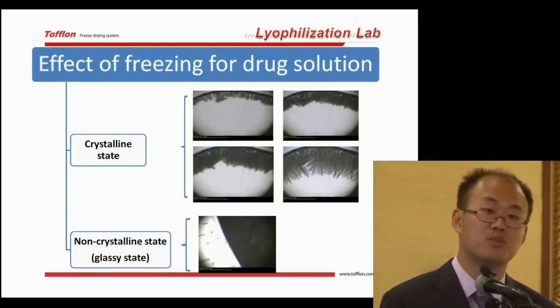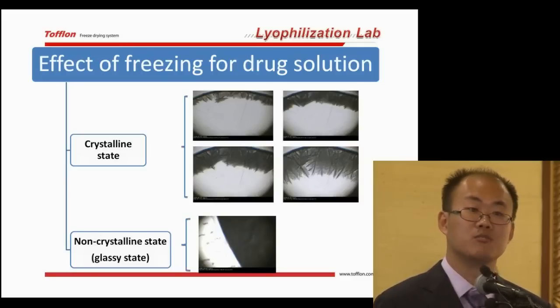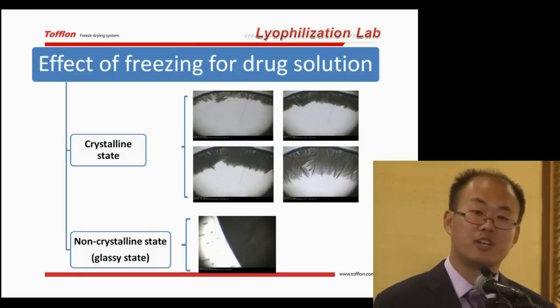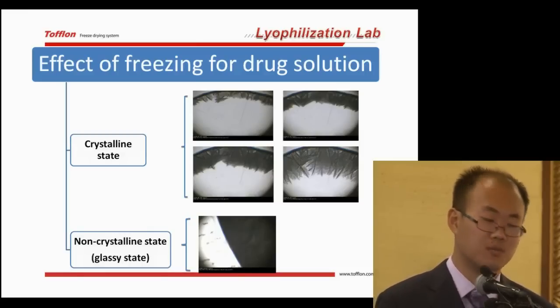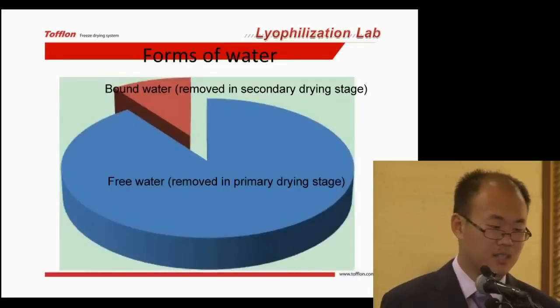There's a difference between the crystalline state and the non-crystalline state. These two states give different results when we perform the freeze drying, so we perform it with different methods. So let's go to the next.